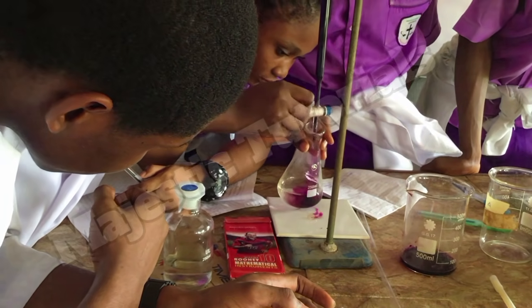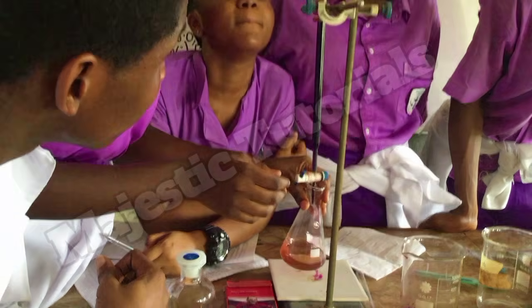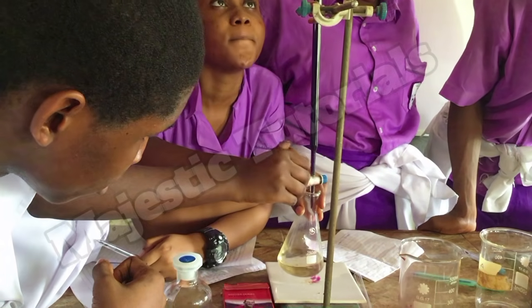Avoid this error, you see them here. They are adding the KMnO4 on the walls of the conical flask. No, add it directly to the analyte, which is the oxalic acid, for accuracy.